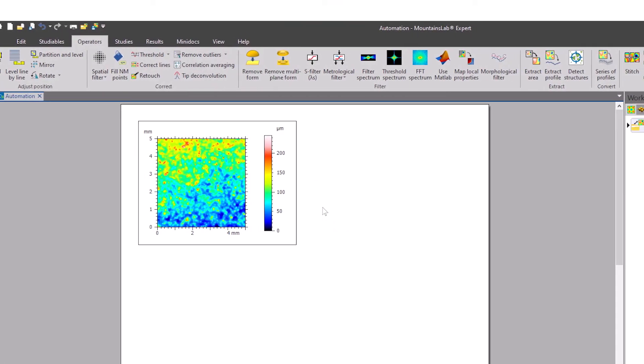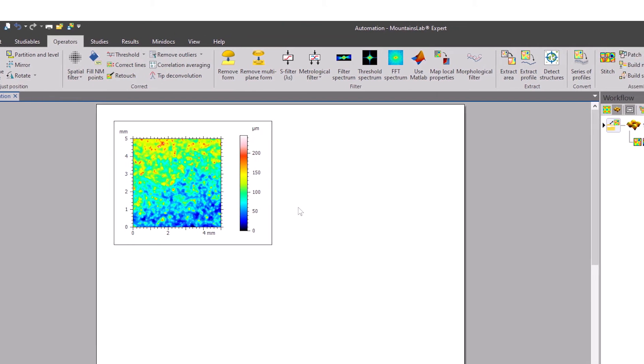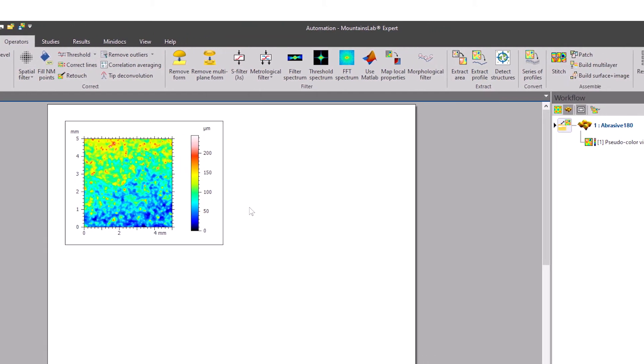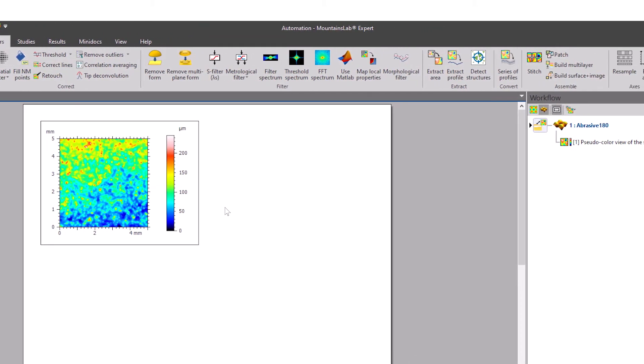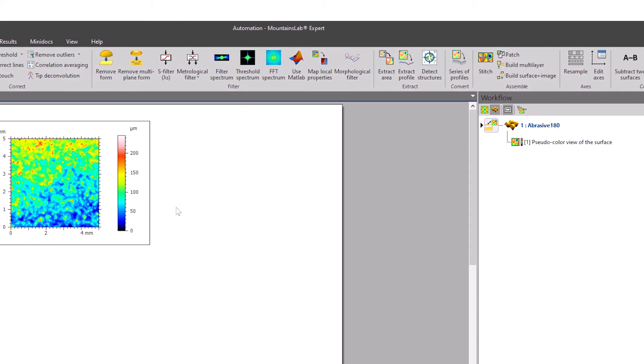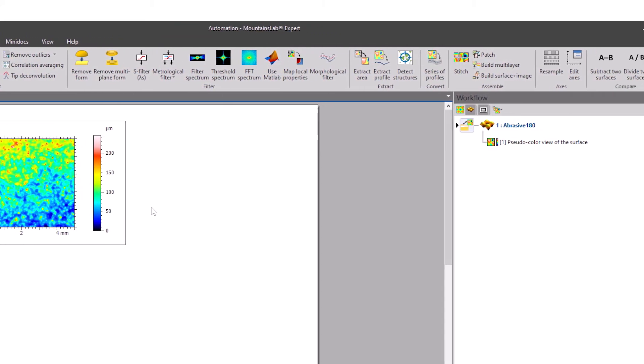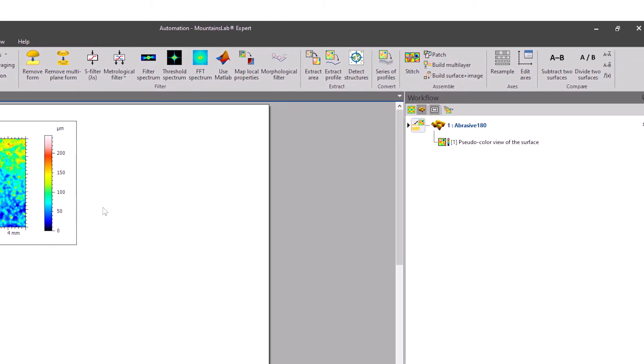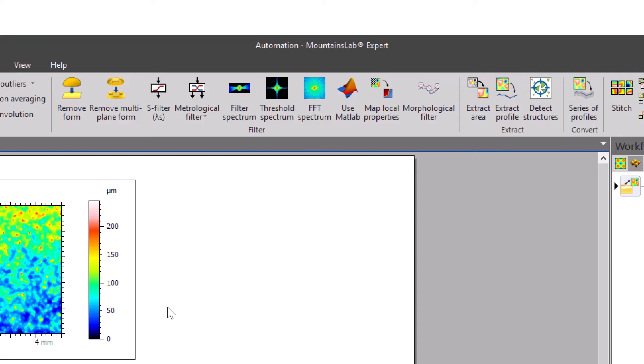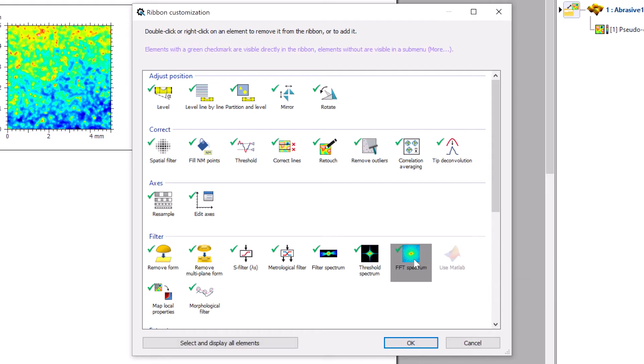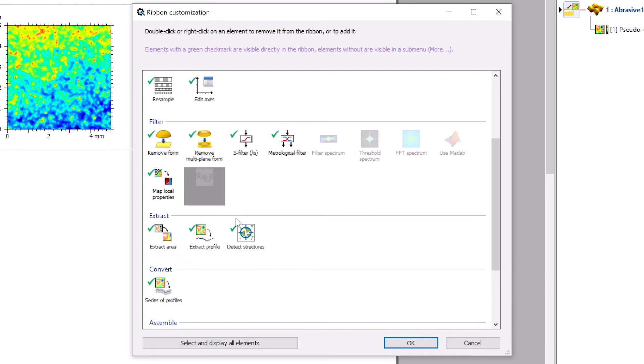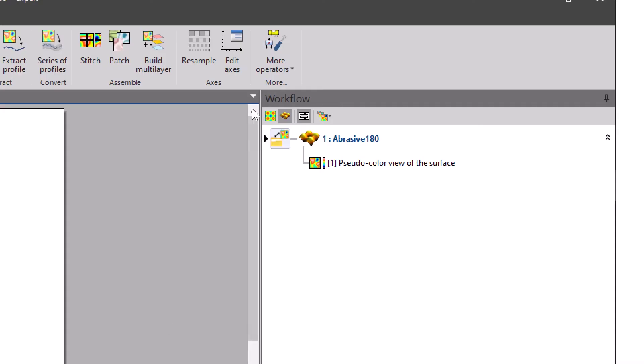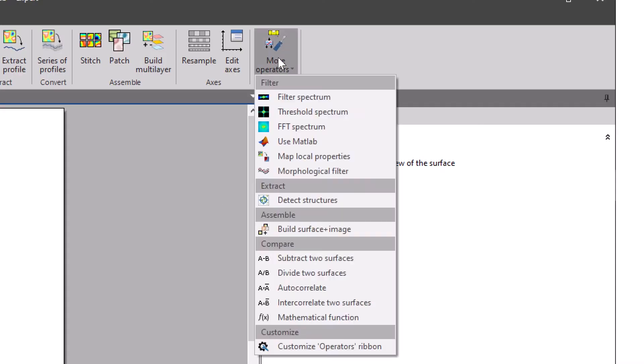Similarly, if you often use the same tools for analysis in Mountains, you can choose to make the ones that interest you more easily accessible whilst hiding the others. Right-click on the ribbon in the operators or studies tabs and choose the icons you wish to show or hide. Any icons removed are still accessible via a drop-down menu.